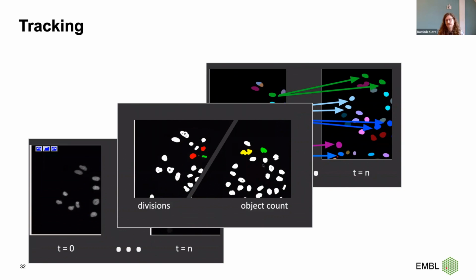And the second classifier you have to train is an object count classifier, because segmentation will never be perfect, right? You will always have objects touching each other in a way that you cannot separate them with the techniques presented here. And in order to deal with this, still through the tracking timeline, you have to teach a classifier how to recognize objects that are more than one.